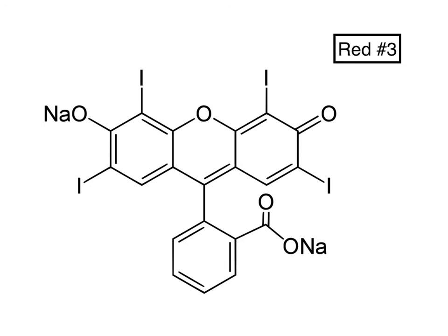So you can see in all four of these that they're kind of mixed molecules, mostly non-polar, but they do have functional groups, hydroxyl groups, amino groups, sulfate groups that lend some degree of polarity and will affect how they interact with the solvents.